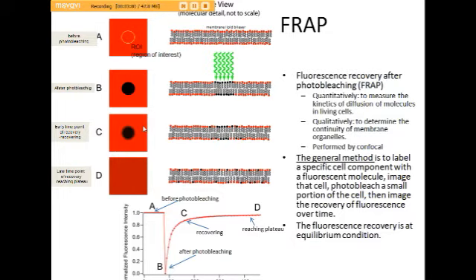By the way, take note that except for the fluorescence property, these molecules are non-fluorescent and these molecules are fluorescent, but the two populations have exactly the same physical and chemical properties. They diffuse and eventually reach equilibrium. It's homogeneous. Take note that because of the contribution of the photobleached molecules, once reaching the new equilibrium, the fluorescence intensity is lower than before photobleaching.